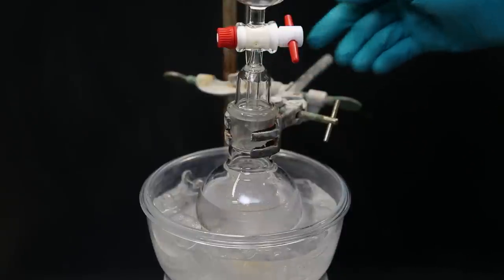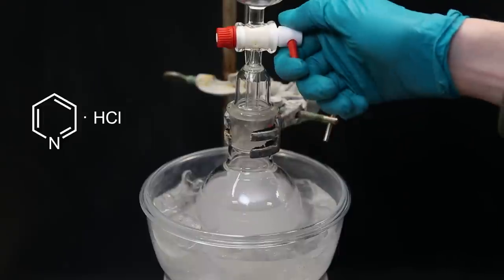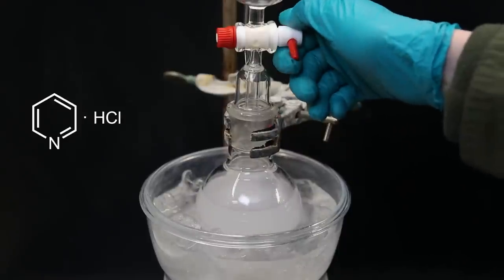Immediately a white precipitate forms, which is pyridine hydrochloride. This is because the pyridine in the mixture is a base that is able to bind hydrochloric acid that is formed during the reaction. The pyridine hydrochloride is insoluble in the solvent, and thus precipitates out as a white solid.